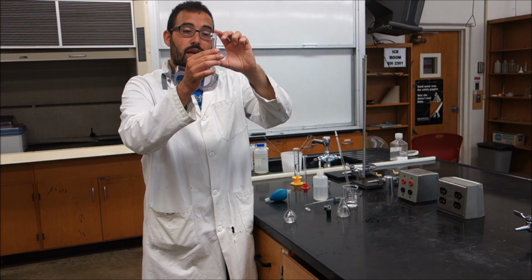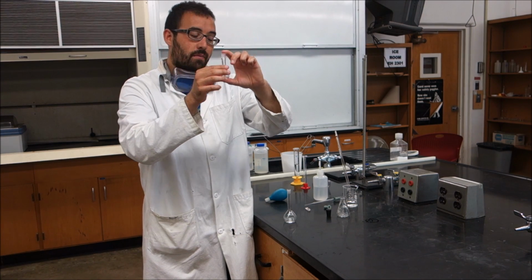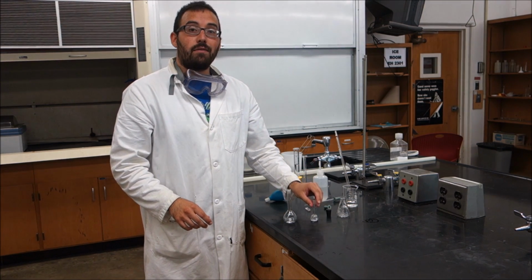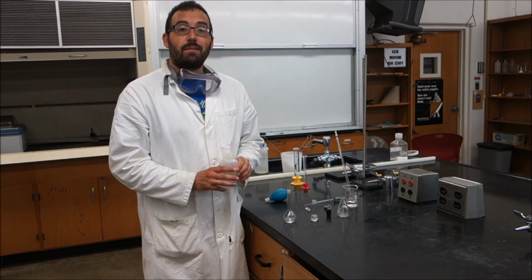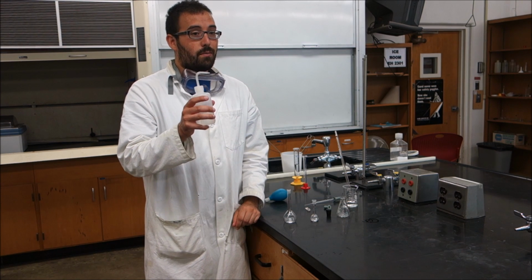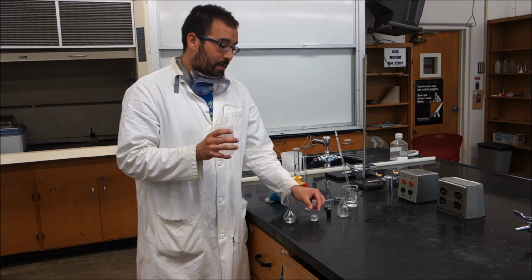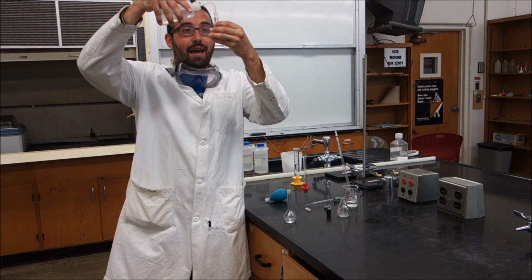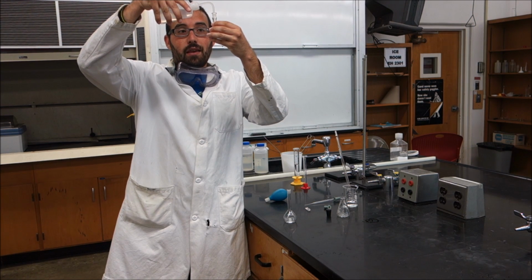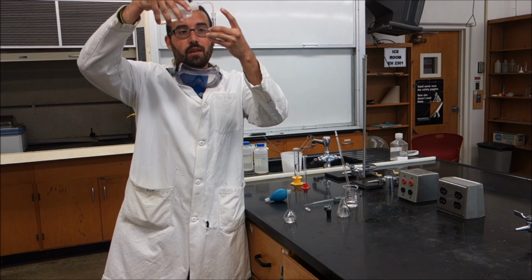Now you may not be able to see it in this video, but your volumetric flask has a little white mark that we're going to fill it to. Now a lot of people make the mistake of trying to just go to the sink and fill it up. What we can do is we can have something with a little bit more control, either with the squirt bottle, again, not a water gun. I know this looks fun, but don't do it. We can take this and we can fill it up to the mark. And again, notice how I have it at eye level here. And we can fill it up at a controlled pace, and then once it is to the mark, I'll go ahead and stop it.